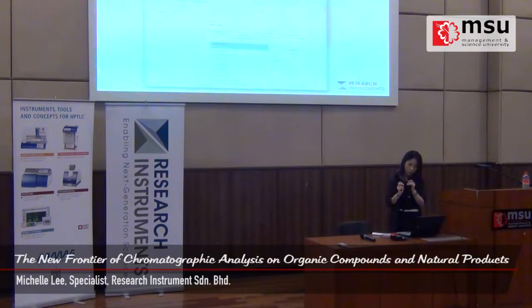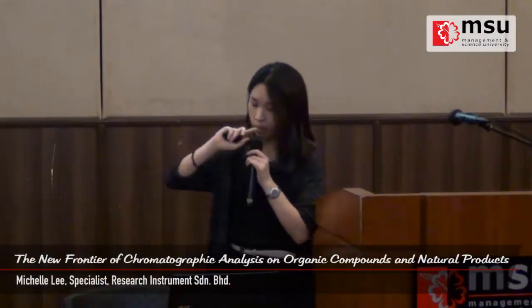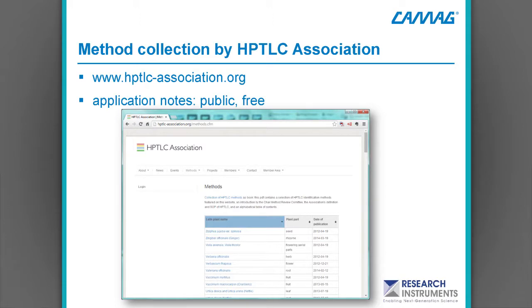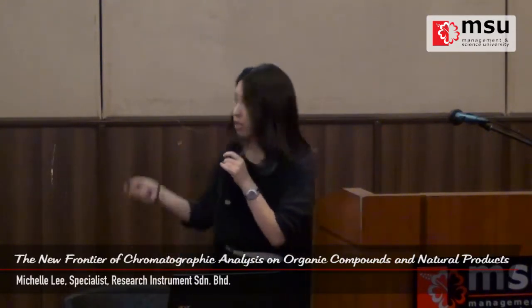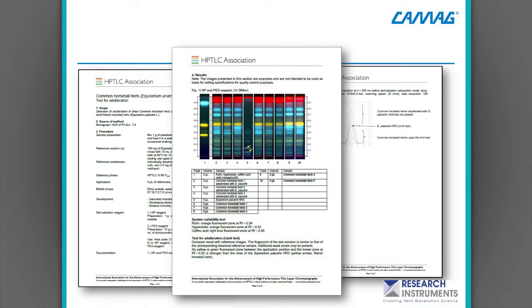Alright, so just to share with you, if any one of you are actually doing TLC, you can actually go to this website. This is actually a public website. All you need to do is sign in, register. You don't need to pay anything. And you can actually download some methods from there as well. Okay? So what you will get is all the documents and how to prepare your samples.